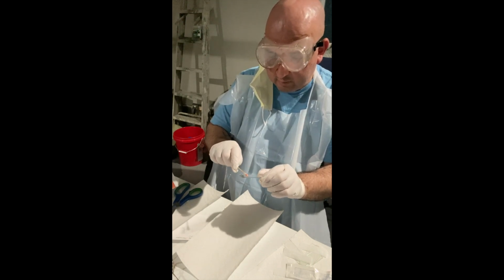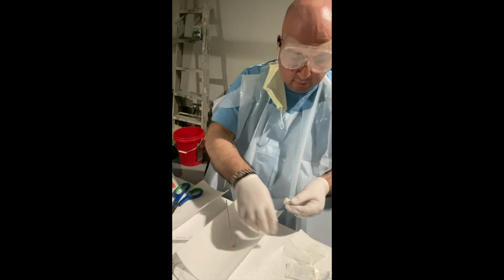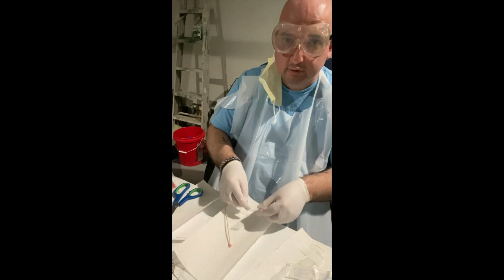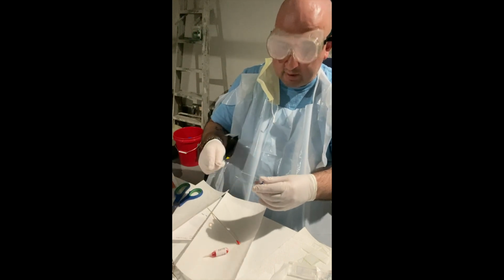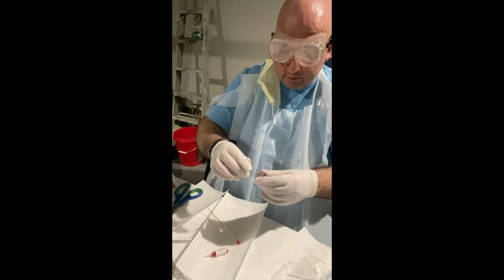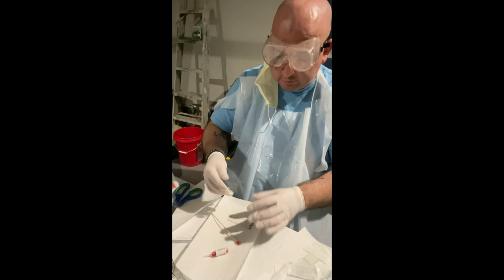That's not what I wanted. Okay, so now using this other slide, I'm going to do my best to do it at a 30-degree angle and then just draw the stain across the slide. Okay, so now this has to dry completely.